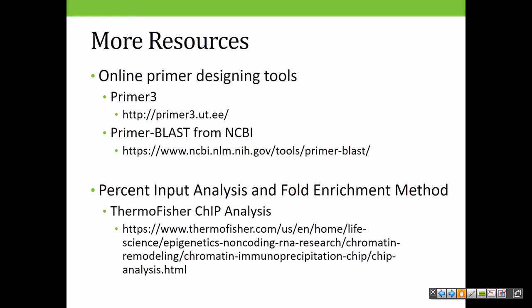There's Primer3, that's my favorite. Others, I've seen a lot of people talk online about Primer-BLAST from NCBI. I believe the library can also help you. Give a plug to the library here. If you need help designing primers, they're here to do that. I didn't know that until they told me, so feel free to contact them. That's what they're here for. So it's like, hey, I need help. Please help me. They'll help you.